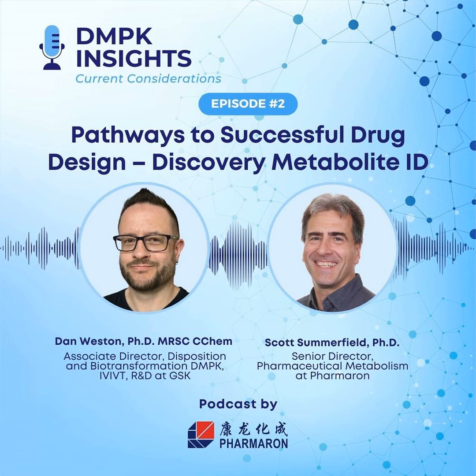Particularly if you're looking at reducing bias, it's something we're looking at in the future now, so that you don't use your predictions first. You look at what the data are saying, and the data leads you, and then you can use predictions, manual intervention, and a number of other rules that a biotransformation analyst would use manually to find compound-related material. I think it's really about using these tools in concert.